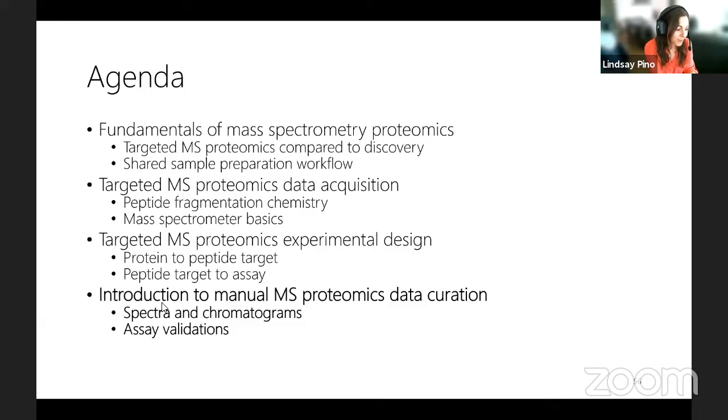Why are you re-equilibrating at 50% B? Because that was just an example. You should re-equilibrate at starting conditions, to be clear.